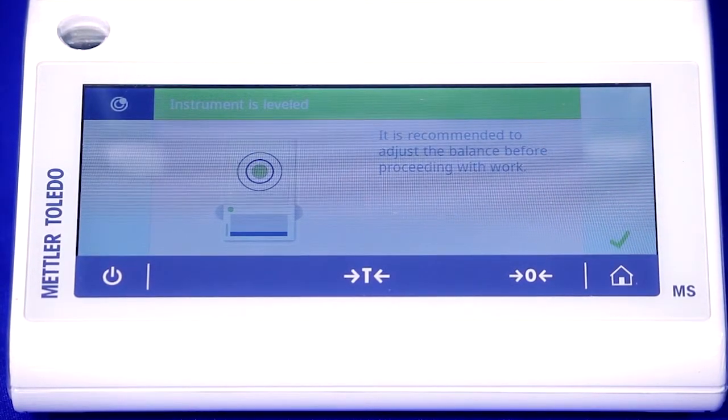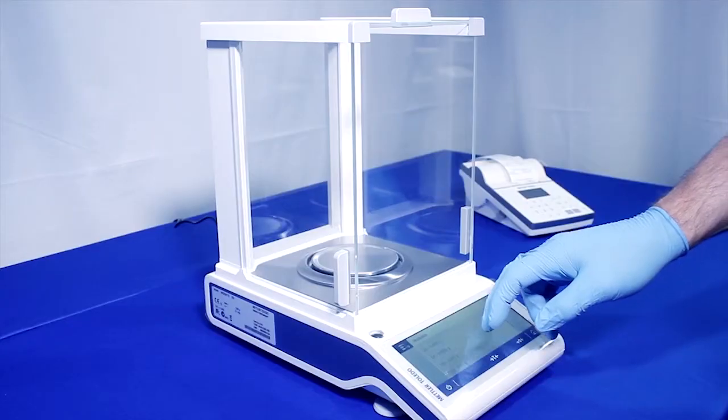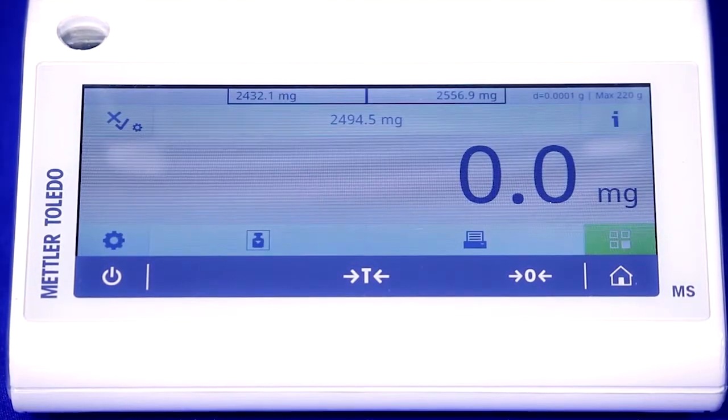Changing the measuring unit on the balance is easy. Just click the unit on the touchscreen and choose the units you desire, milligrams, grams or kilograms, for instance.